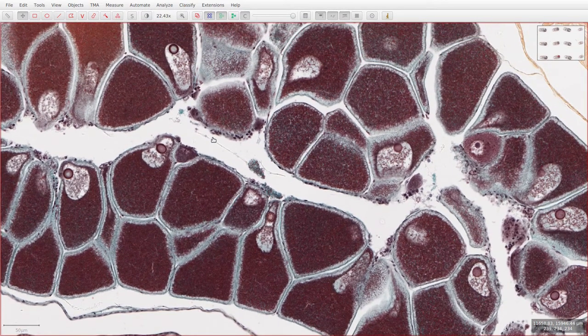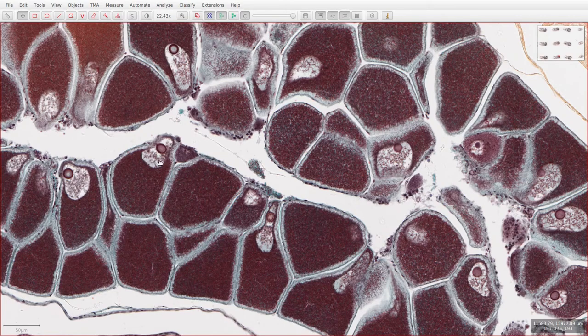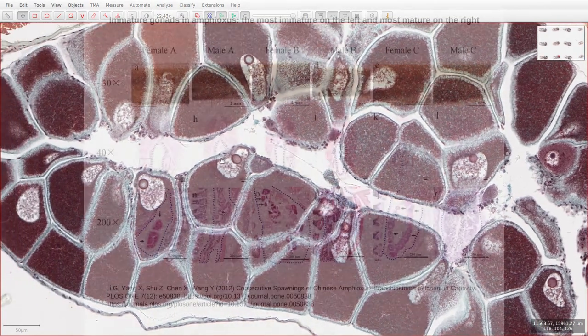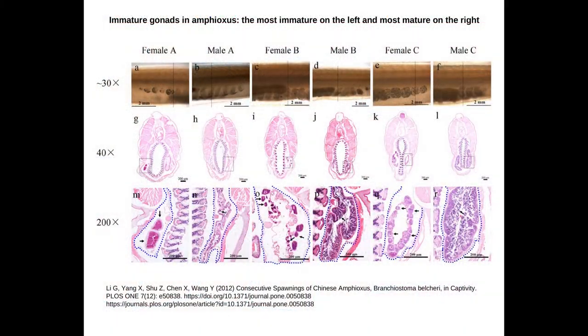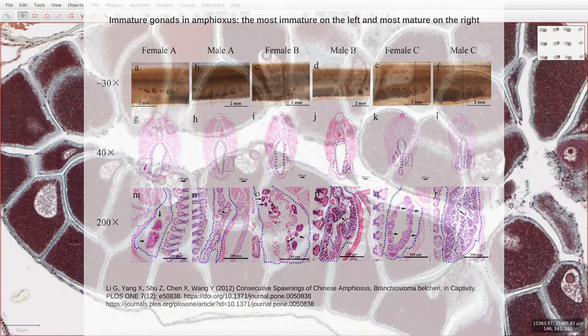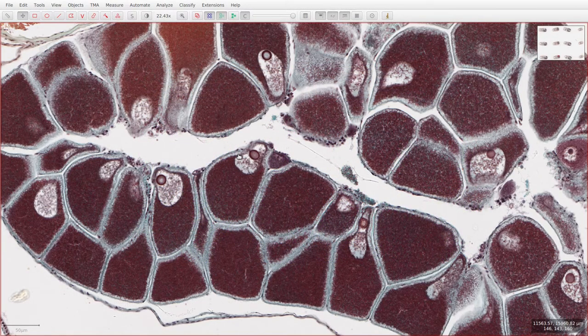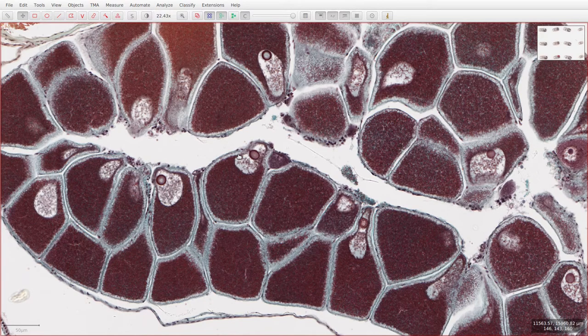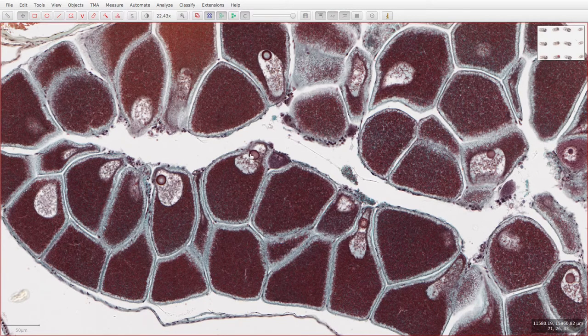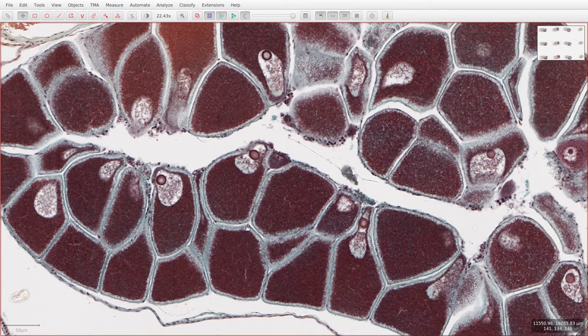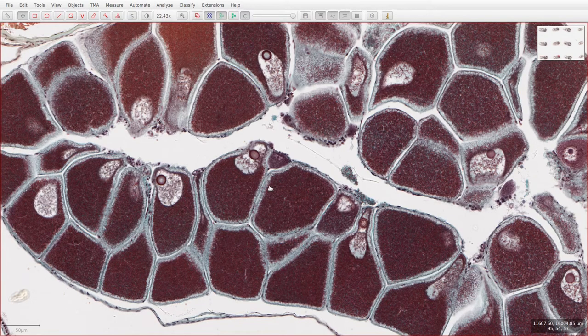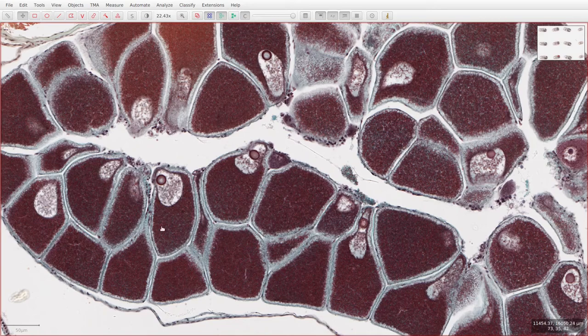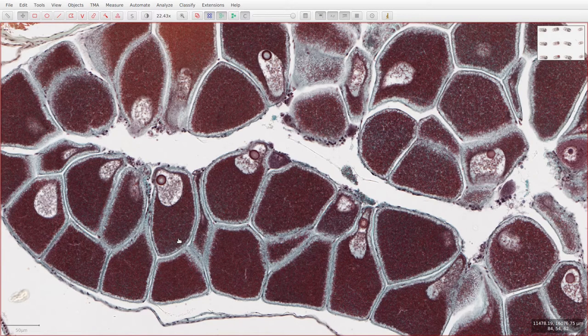The size and structure of the ovaries will depend on the maturation of the egg cells. Unlike in mammalian ovaries where you'll get various different oocytes at different stages of development, because the amphioxus rely on external fertilization, it's beneficial for them to release all of their eggs at the same time. So all of the oocytes here will be at the same stage of maturation, and as you can tell by the size of these cells, these are pretty mature oocytes.